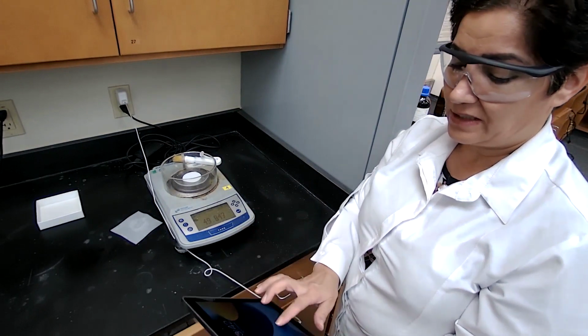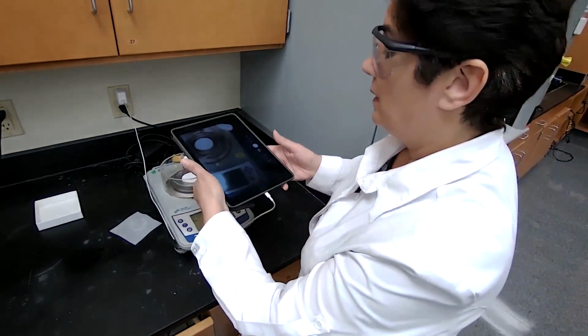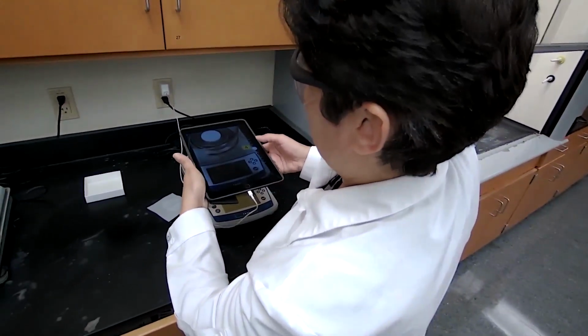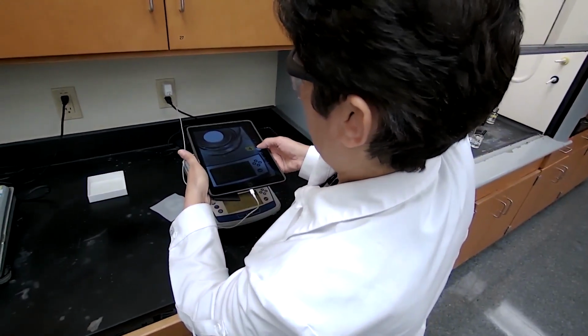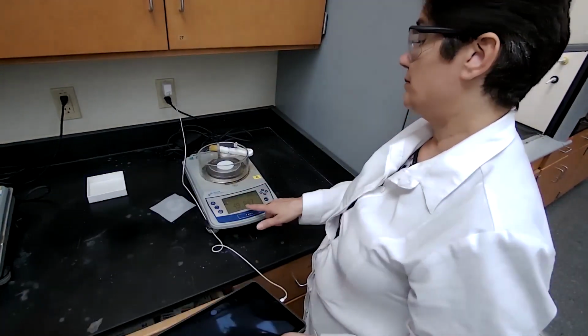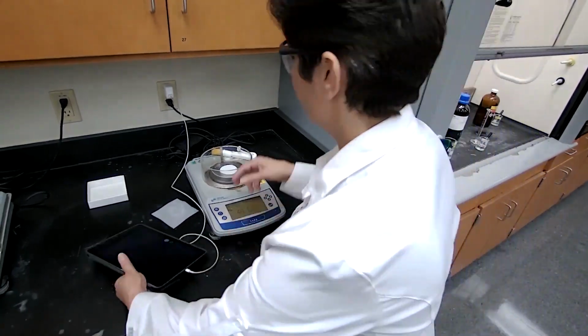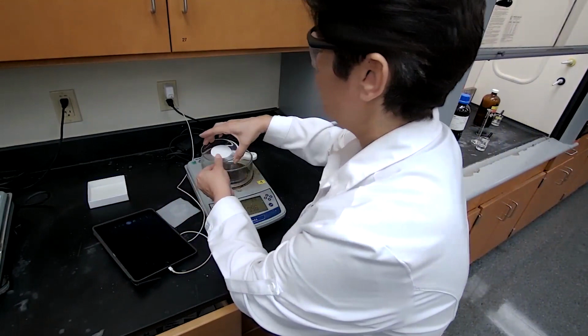I would also take a picture. 49.847 grams.